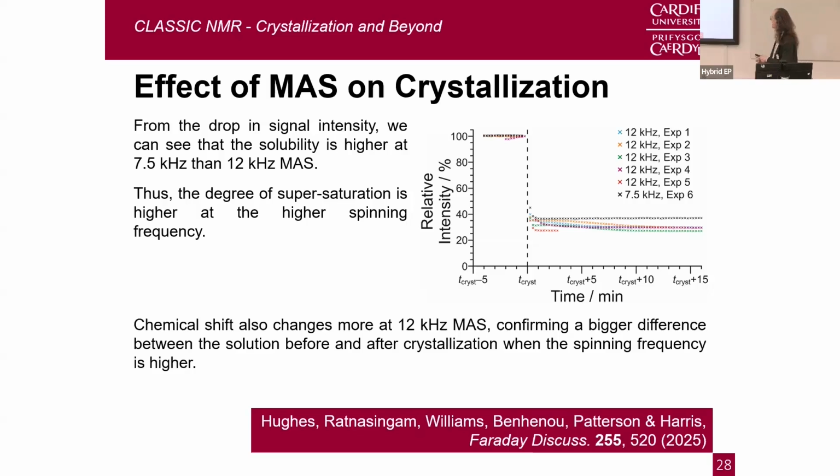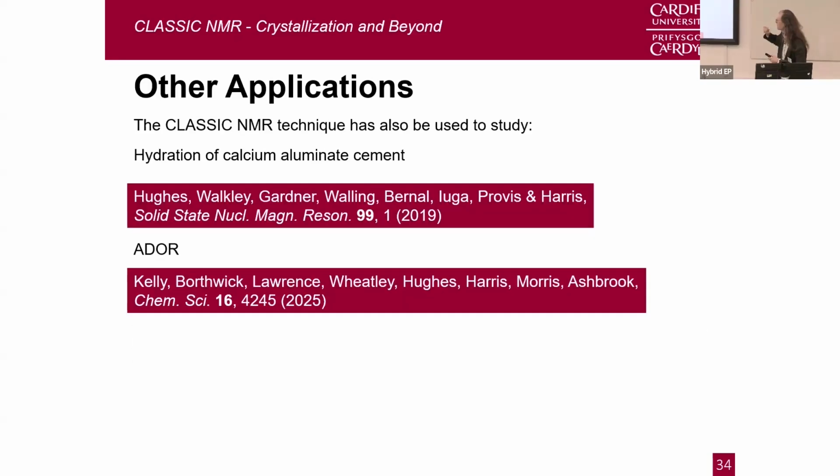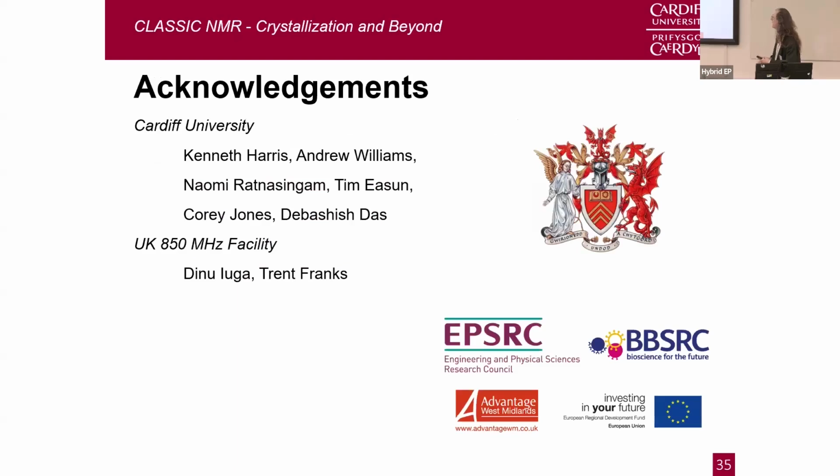That's telling you there's more of a difference between the solution before and after crystallization when you've got that higher MAS frequency. Very recently, we've just published a very nice paper with Sharon's group looking at the ADOR process. So please do have a look at those as well.